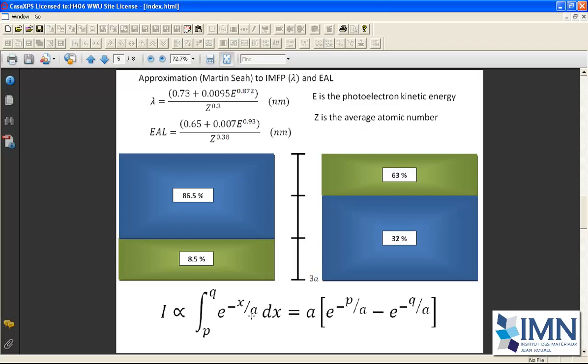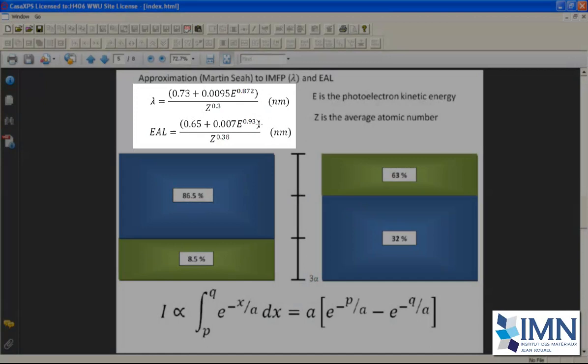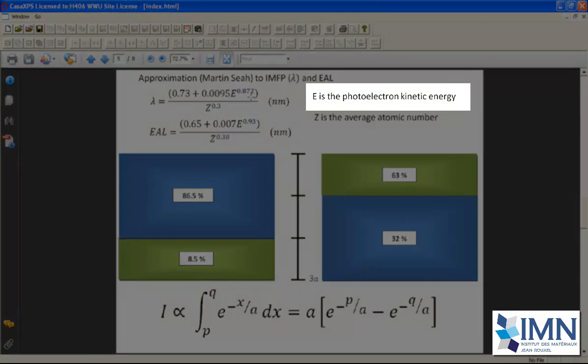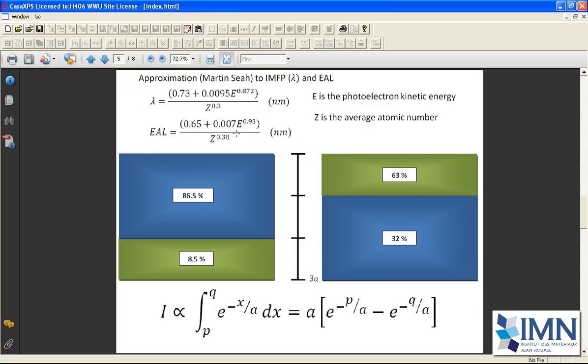What happens is that this parameter a varies as a function of the kinetic energy, and here we have two formulae that estimate the attenuation length. One is based on the inelastic mean-free path, and the other is an effective attenuation length, and both are designed to try and measure the depth from which electrons can emerge from a sample. So we have an energy dependence, and therefore a peak that appears at a different kinetic energy from another peak will have a different attenuation, and so this must be part of any quantification of XPS spectra.